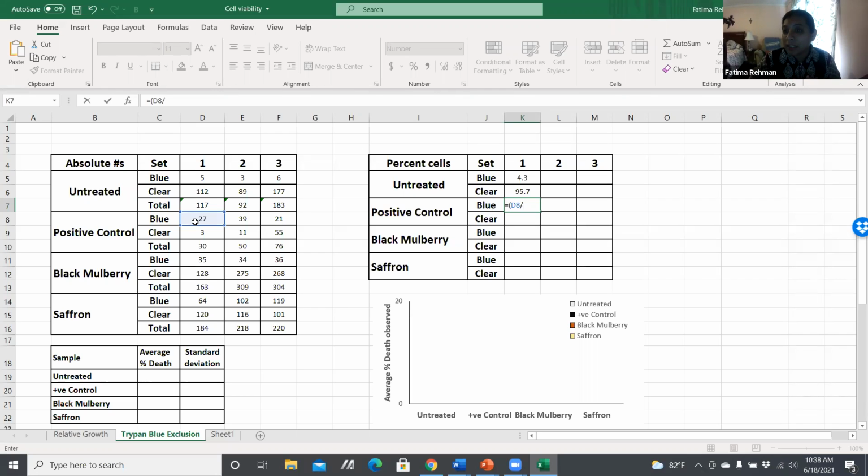And I encourage my research students to do the same. When we design our experiments, we prepare our Excel sheets preemptively, complete with formulas for analysis. So as they get the numbers each day, they just input the numbers and voila, their charts appear. And that's helpful because then you can start to visually see those results coming up immediately.